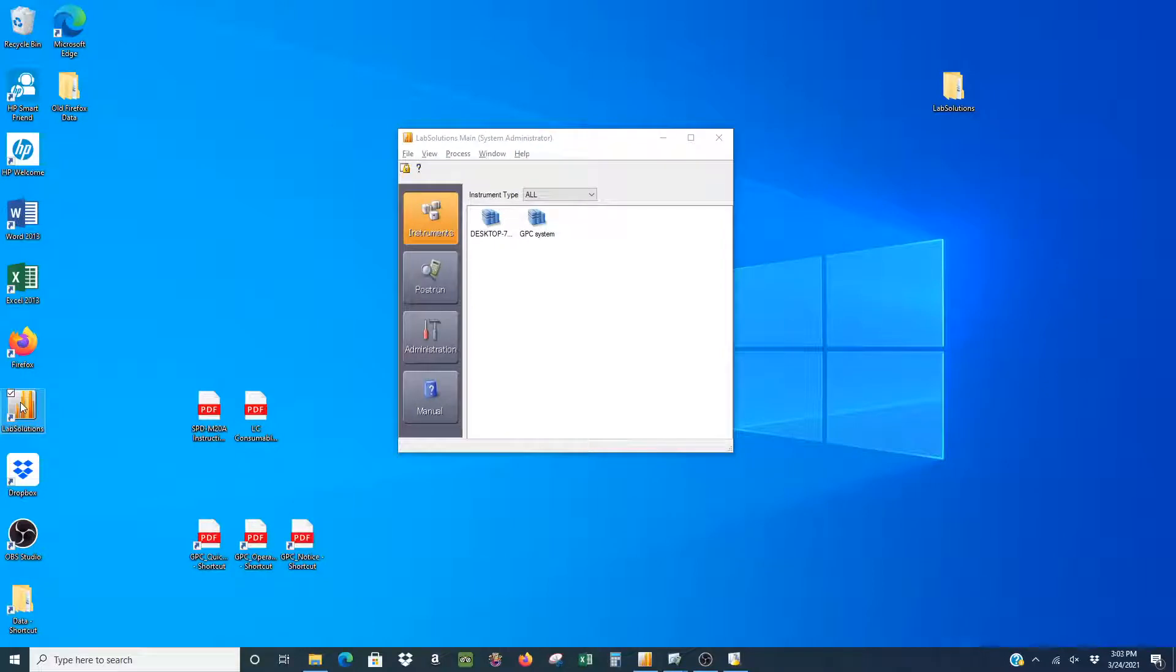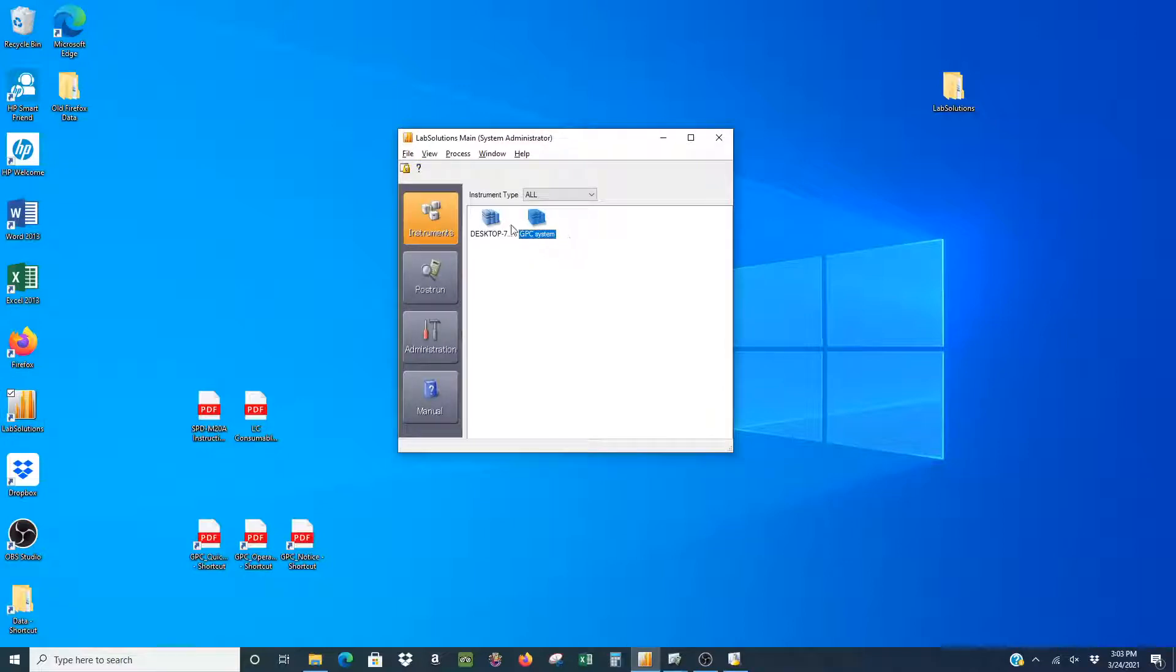To start, you have to go to the Lab Solutions main window and click on Instruments on the left-hand side and GP System.